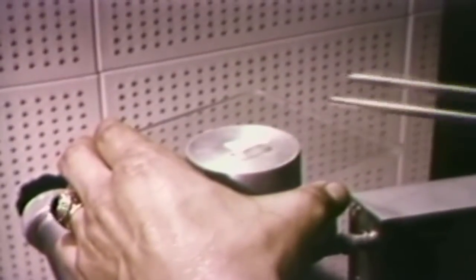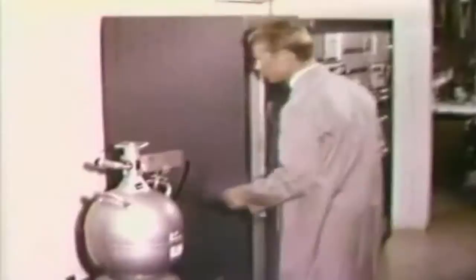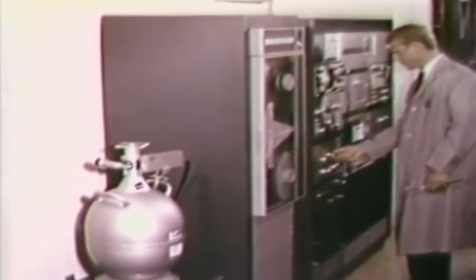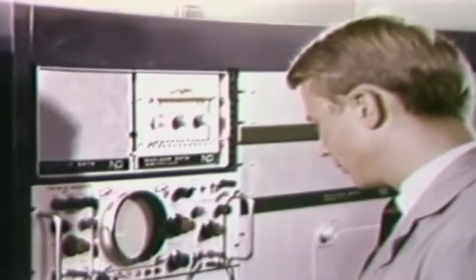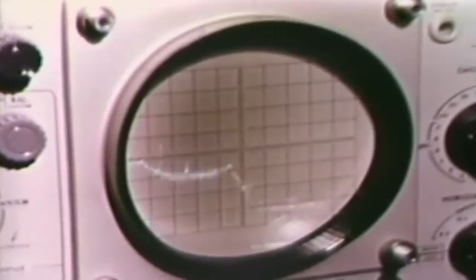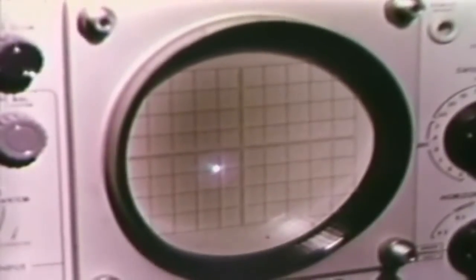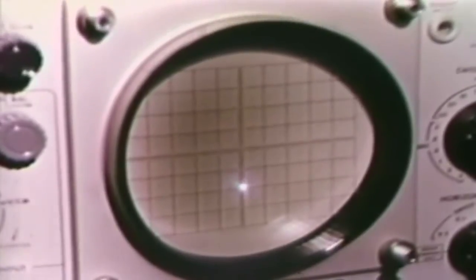In the neutron activation analysis unit, the examiner places samples, now partially converted into radioactive atoms, on a detecting device. This detector, coupled to a multi-channel analyzer, measures the emissions from the radioactive atoms and sorts them out so they can be individually identified. This process is continuously monitored on a cathode ray tube. After sufficient time for the data to accumulate, it can be photographed as well as read out on the viewing screen.